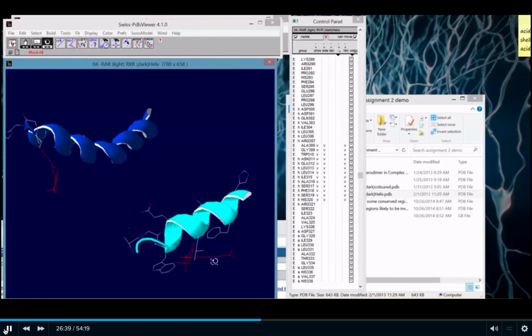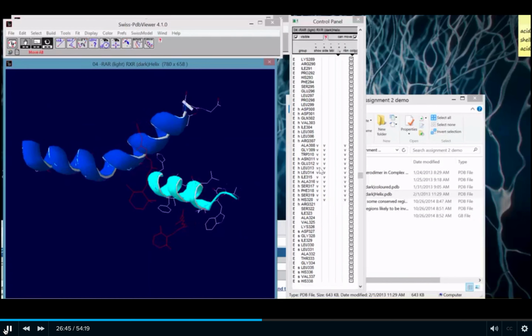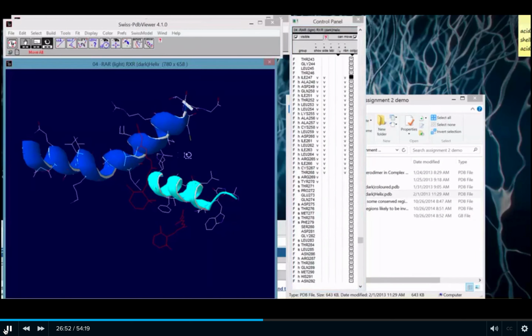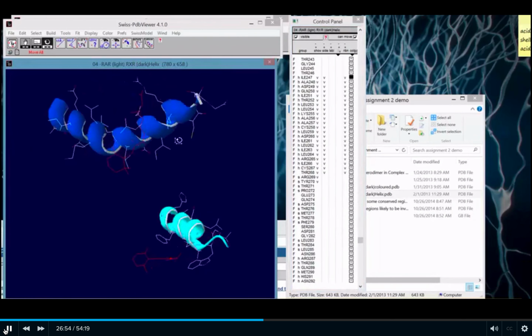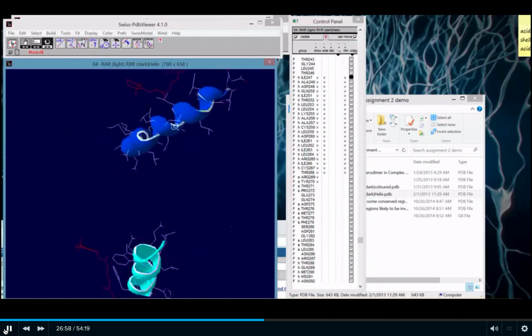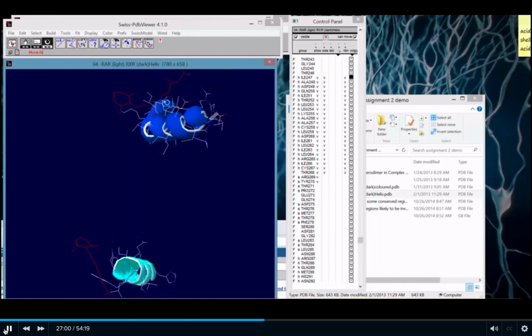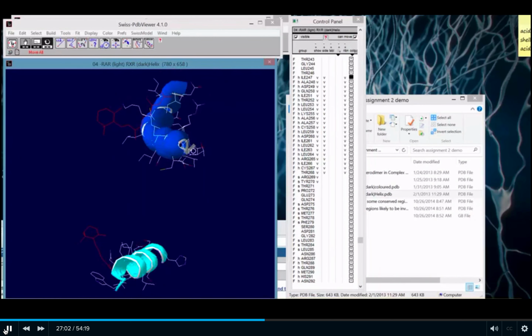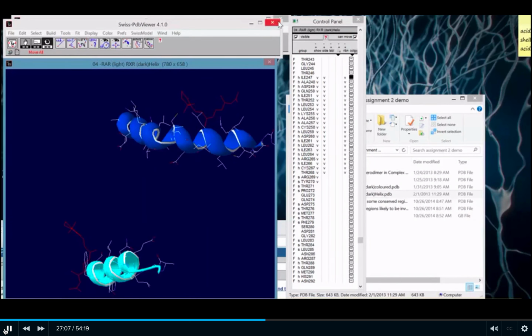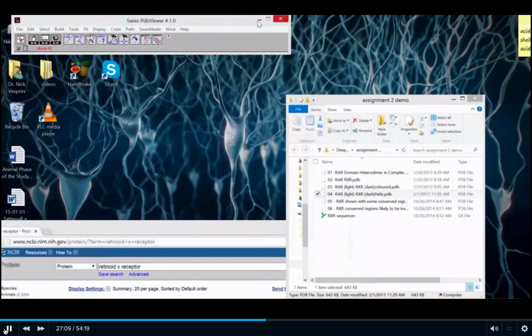And importantly, this is a hydrophobic tail. These are hydrophobic residues. They all integrate very nicely. This helix does not allow that. There's a steric hindrance, a blocking just by the backbone of the helix itself. If we were to continue, it just simply cannot fit. It gets in the way. Even though we might have a hydrophobic helix here, there's some charged ones over here, and that just simply gets in the way. So there's physical hindrance as well as a charge distribution there.